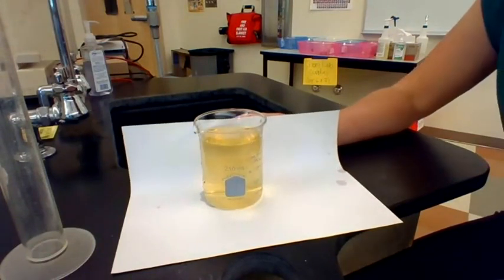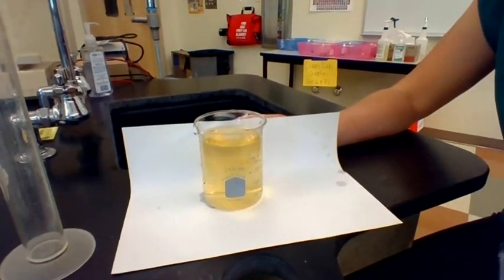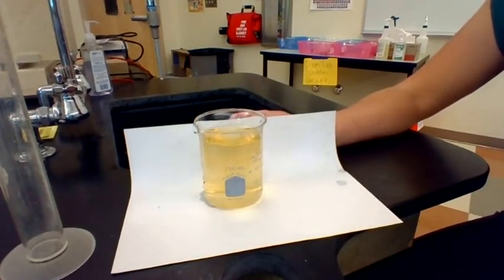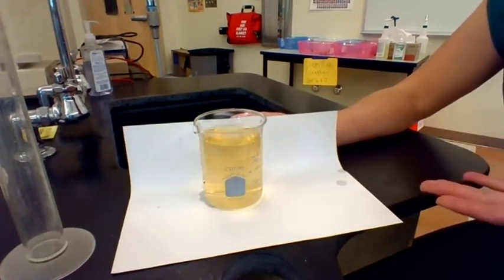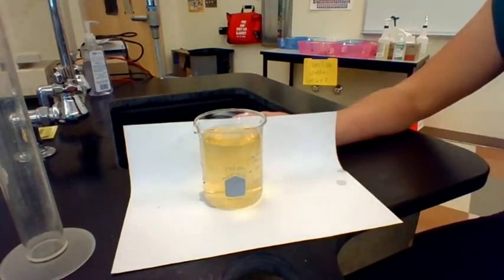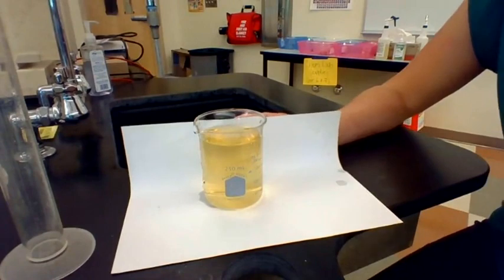And that's because the pH is a logarithmic value. So it takes a 10-fold change in concentration to change the pH by 1 unit. So it took a lot of water just to even begin to start neutralizing this acid.